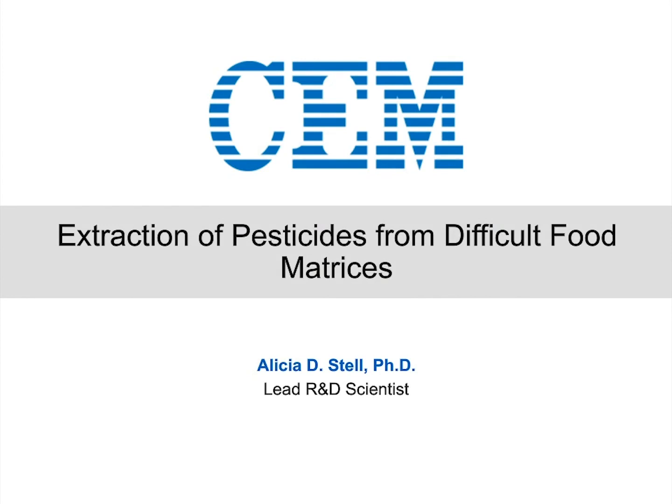As noted, the title of my talk is The Extraction of Pesticides from Difficult Food Matrices. As I go through this talk, I am going to talk about the traditional QuEChERS extraction of pesticides from food matrices and compare that to a new technology, the EDGE. And what I hope you gain is that you see that the EDGE is not only applicable to those standard matrices in which QuEChERS was developed, but also applies to some of the more difficult food matrices where QuEChERS may not be as optimal.